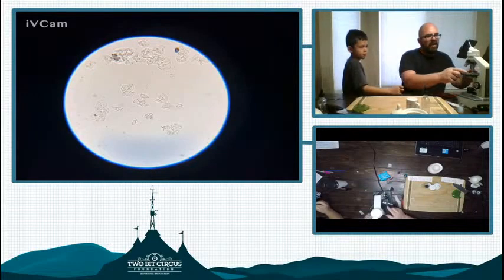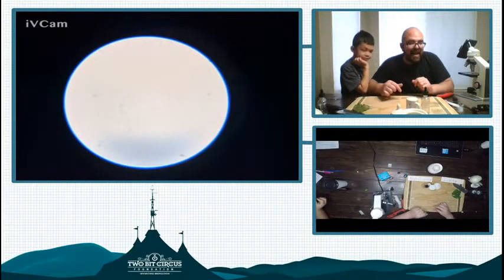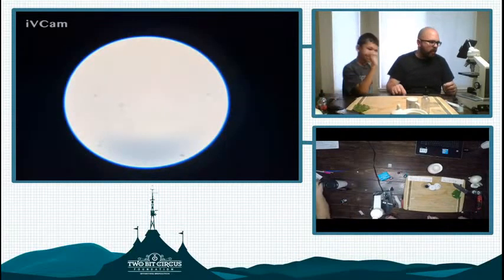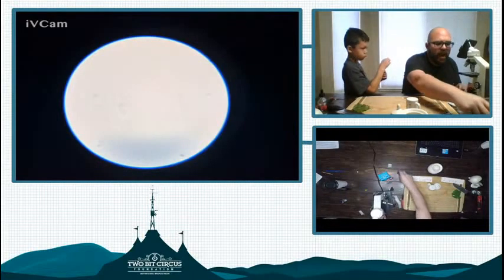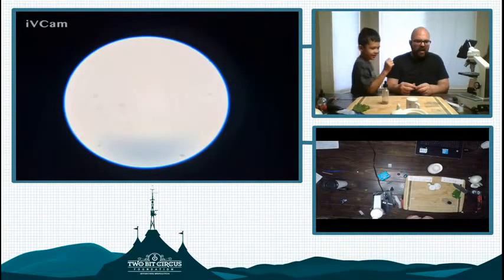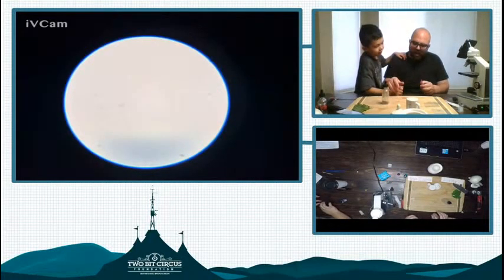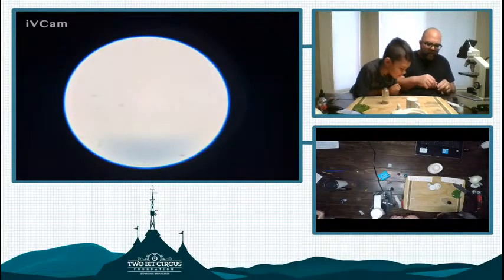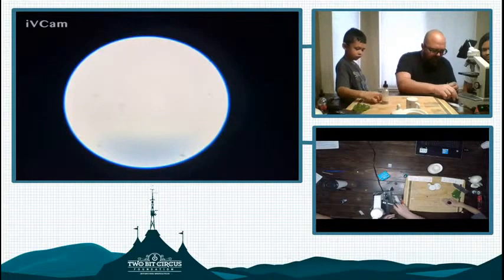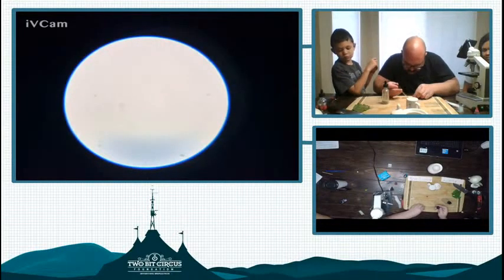I see cells in there. Now something you could do to the cheek cells, that's what we took from Robert's mouth, cells from his cheek, is dye them with a dye called methylene blue, and that will help you see them. But I wanted to experiment whether you could use simple household products to dye the cells as well. A conversation we had was whether normal food coloring that you have at your house, for baking and all sorts of stuff like that, can work. So I am going to try to find a way to get some food coloring on here, trying to see what color I want to use. I don't want a lot, just a little bit. Okay, maybe a lot.